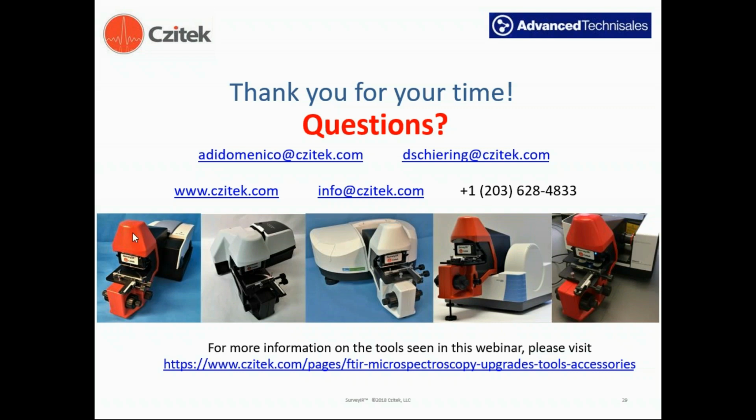All of these spectrometers you see on this image from the various vendors have DTGS detectors installed in the instrument. MCT detectors are more sensitive and require liquid nitrogen cooling.